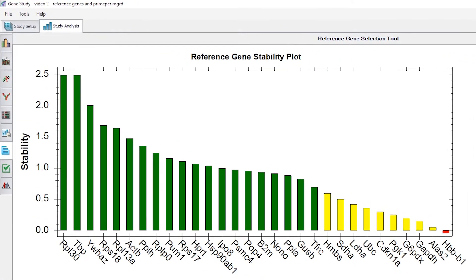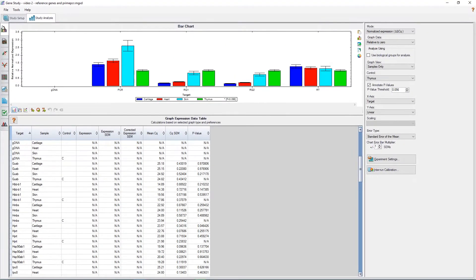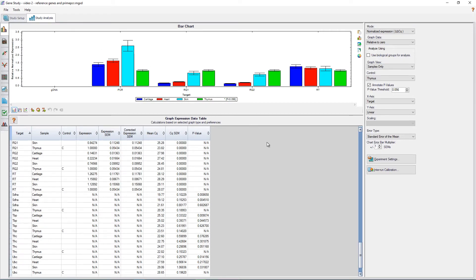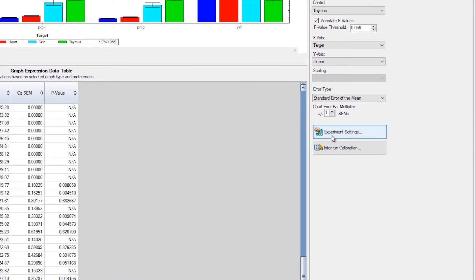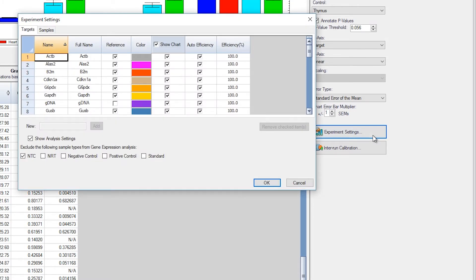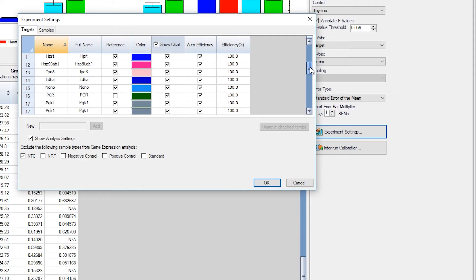To designate potential reference genes, navigate to the left side menu and click on the icon for graphing. This brings us to the Analysis feature that includes both graphing and our experiment settings. Now on the right side of the screen, click Experiment Settings. We are now viewing a list of all genes in the experiment. Ensure that the box is checked next to each gene you would like to analyze as a potential reference gene. In this case, as we scroll through, we can see that we have previously chosen all genes, excluding controls, as potential reference genes.